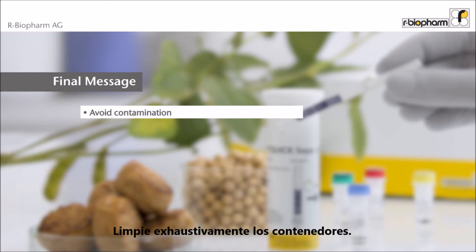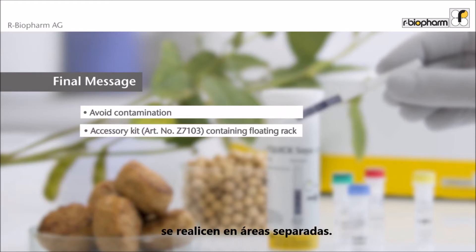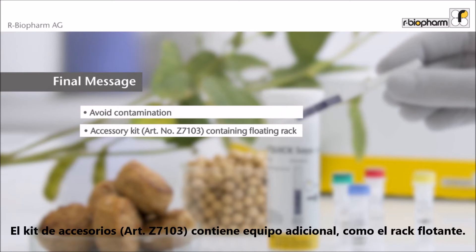Avoid any contamination — clean vessels and the laboratory thoroughly. Separate rooms for extraction and test procedures should be used. The accessory kit contains additional equipment like a floating rack.